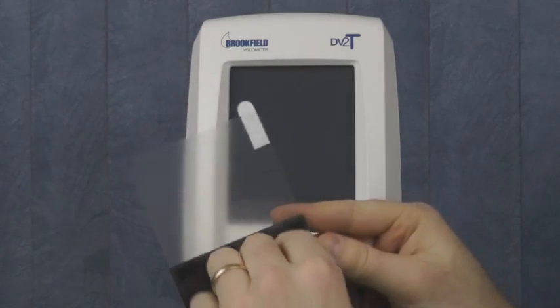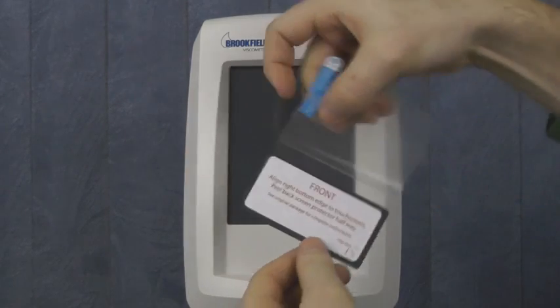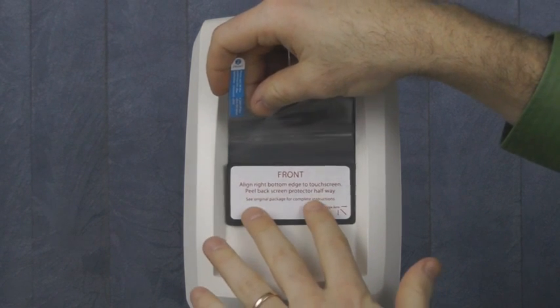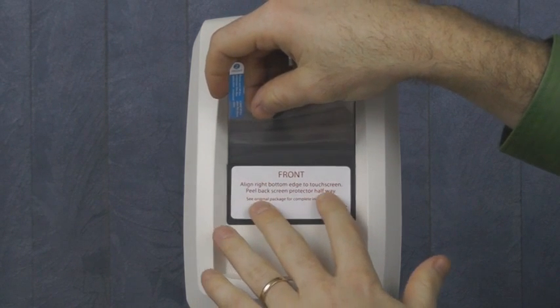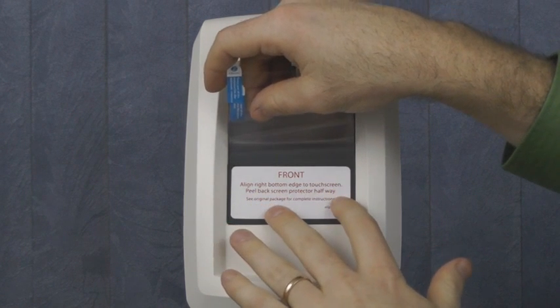Remove the bottom half of tab 1. You then align the foam backing of the protector to the bottom right hand corner of the screen. Alignment is critical. If the screen protector is not aligned properly, you may lose functionality of the touch screen.